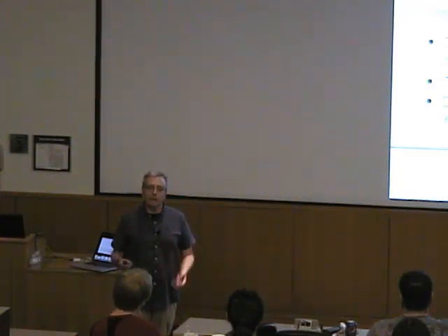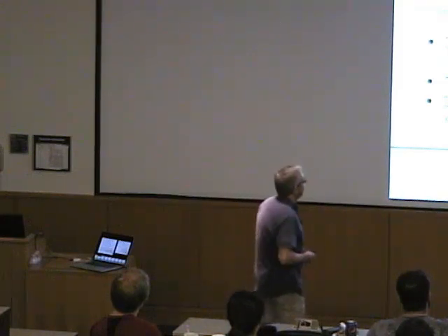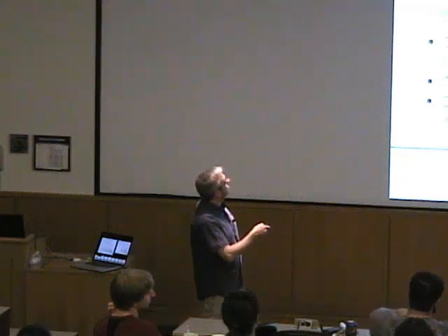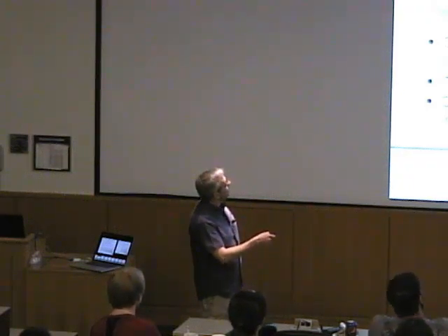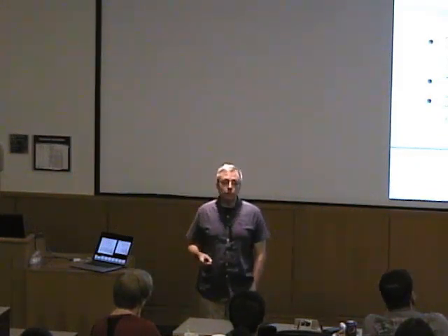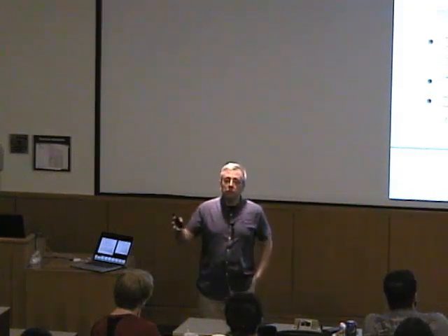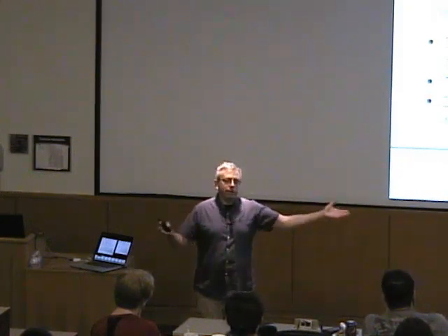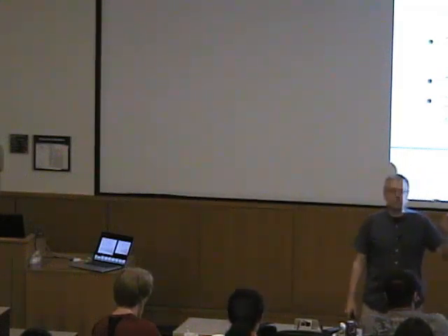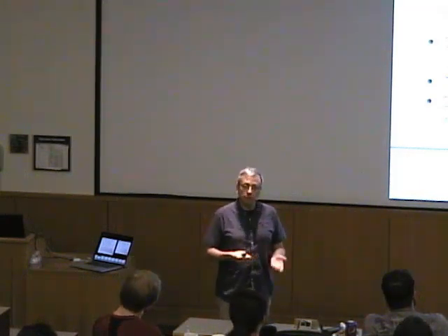Because once you have everything together, the Fourier transform is a rather simple process. Okay. And just to close this up, finally, the methods that I'm also not going into detail about: there are two ways of getting these substructures. One of them, the brute force approach, is to say, well, there are no substructures in there. I can't use 10,000 carbons, that's too many. So I just take some heavy atoms and throw them on top. That's called isomorphous replacement. And if you locate those few heavy atoms, then you can solve your structure.